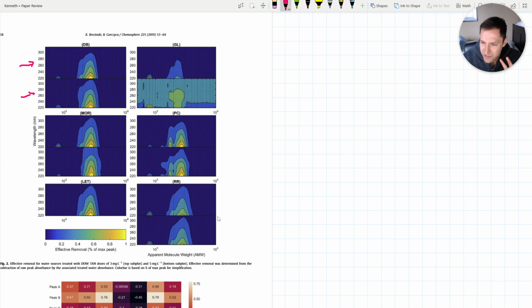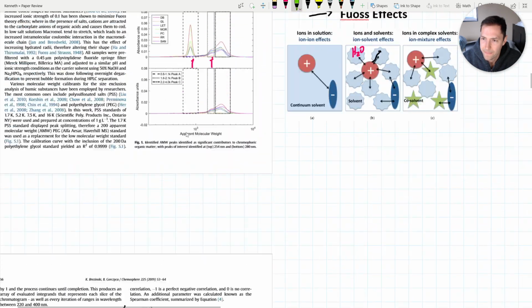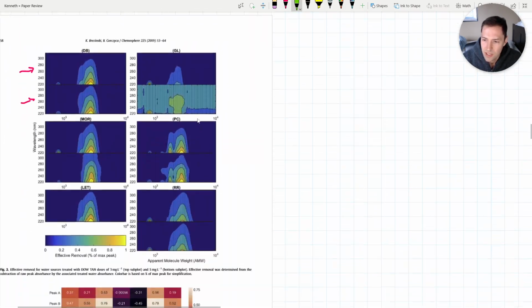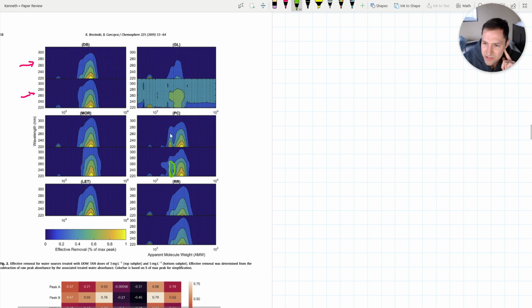So it's a little difficult to pick out if there's anything here, but I would just say, for the sake of argument, that the peaks here are a little larger than here. So when we were contacting with the ion exchange resin, it seems that this smaller peak here, which, just to go back up here, refers to this peak A. See, some samples don't have the peak A. Some samples do. What you find is that perhaps it targeted this a bit more, and not so much this. Right? So again, it's all about characterization. This is just visually looking at it.